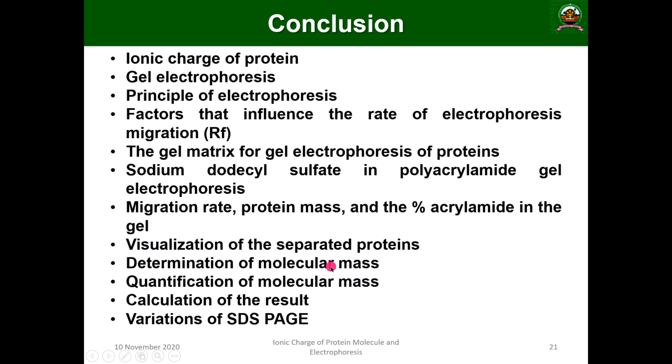To determine it, you need to use a standard. For quantification, you need to plot a graph. Then later you have to calculate the result. How will you calculate the result? And what are the several variations and advancements in the SDS-PAGE method? These are all about protein purification by SDS-PAGE and their ionic charge, dear students.